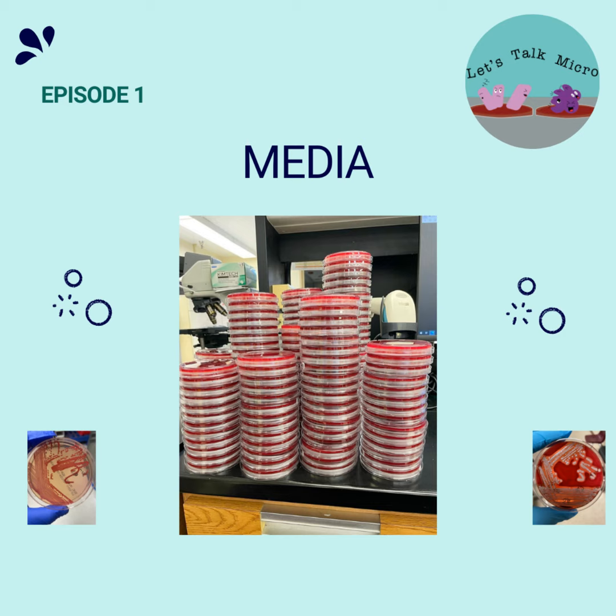Also, you might miss an organism. It's very crowded sometimes, depending on what kind of infection you have, especially if it's contaminated based on the source. You get a lot of skin flora. Sometimes you have patients that have these infections on the foot, with multiple gram-negative rods. So you want to achieve that isolation. It's very important.